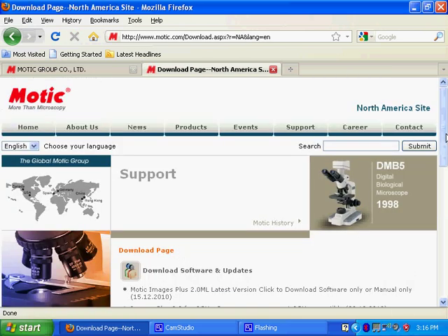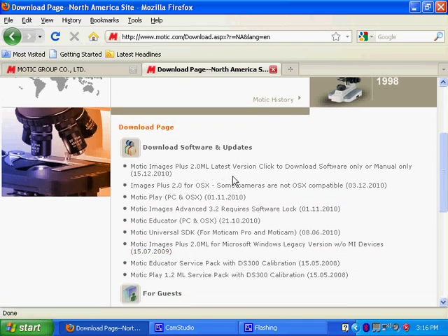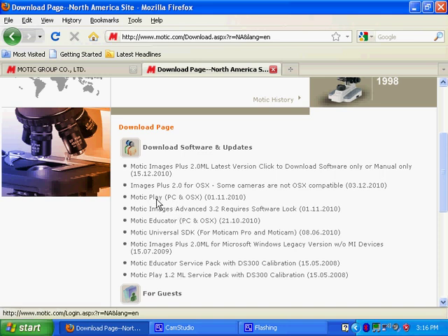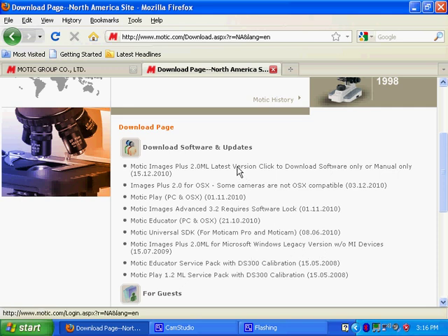For most cases, the software you want is Motic Images Plus 2.0 ML. For high school students or elementary schools that have Microscopes such as the DS300 or the DM52, you would want Motic Play or Motic Educator, but in most cases, you would want Motic Images Plus 2.0 ML, latest version, not the legacy version. Click on that.